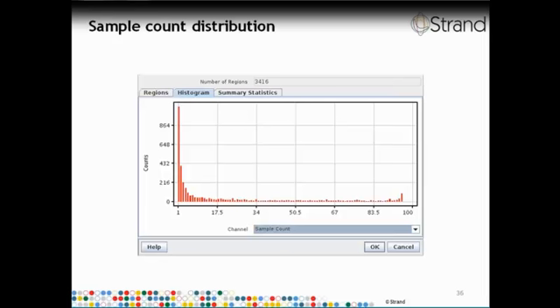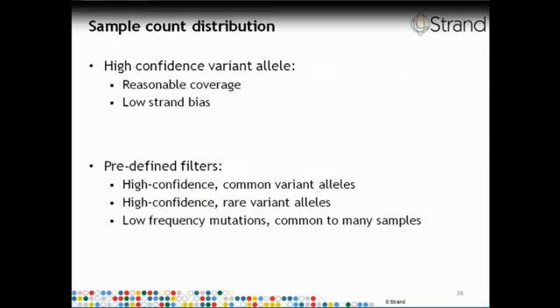For instance, one may be curious what would happen if the supporting reads were changed from 35 to say 60, and the chart shows that if you were to change from 35 to 60, then the total number of variant alleles that would satisfy the filtering criteria would be close to 72.